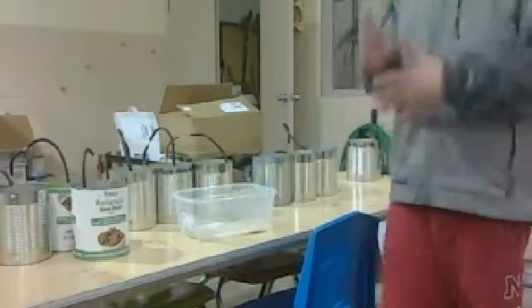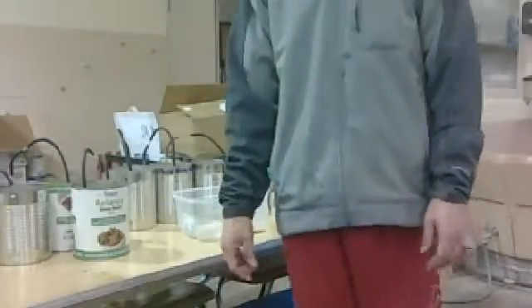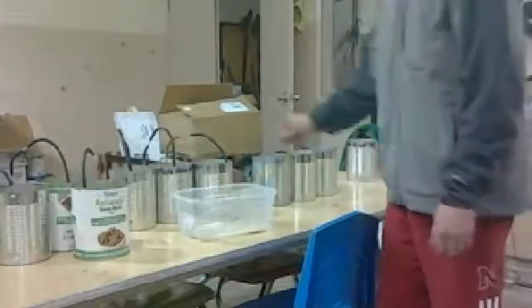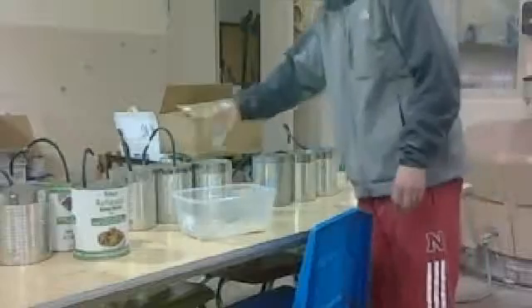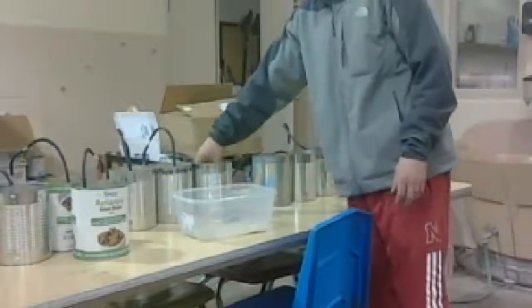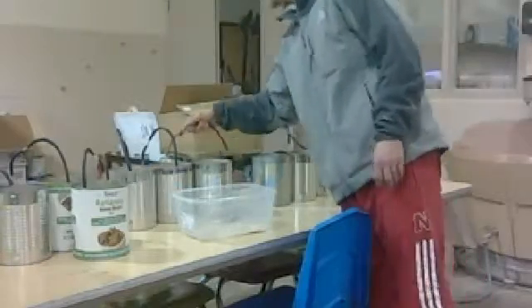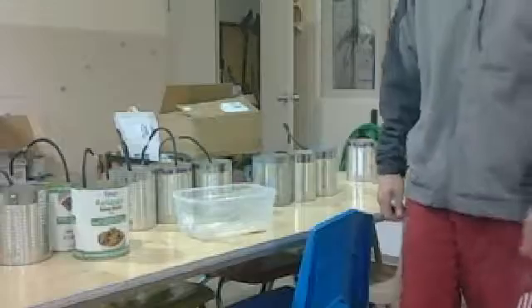Your goal is to get that beaker totally full of water and the tube stuck into that beaker that is totally full of water. I didn't really go over that in the directions, so make sure that when you do this, you take this little guy here and stick it into the water, flip it over full, and then take the tube in. That will help you out immensely when getting ready for the lab tomorrow.